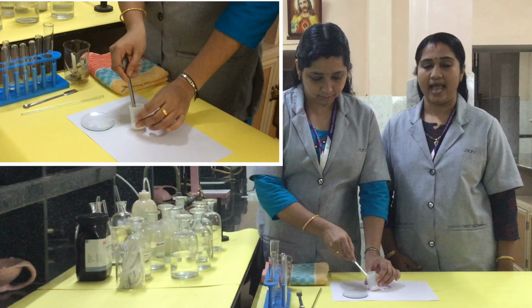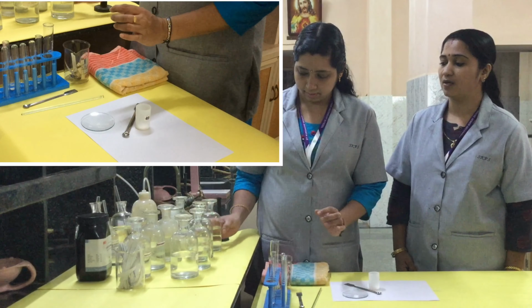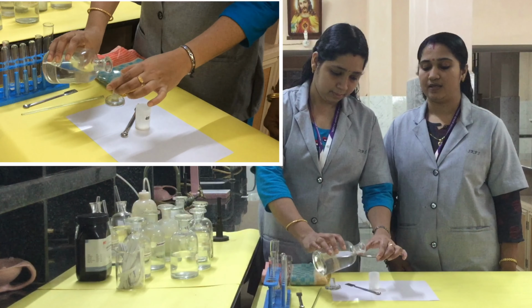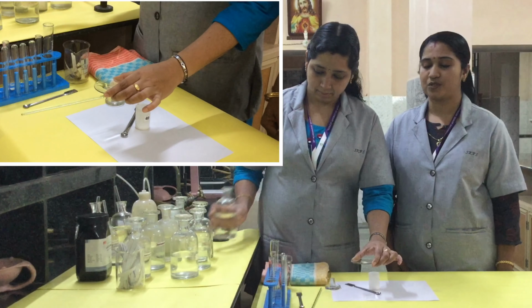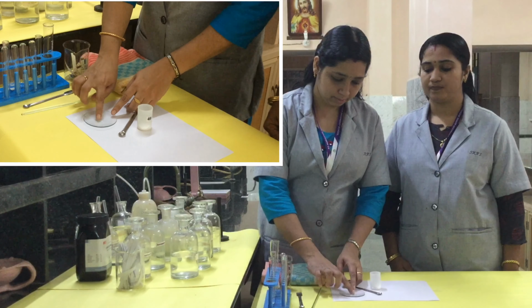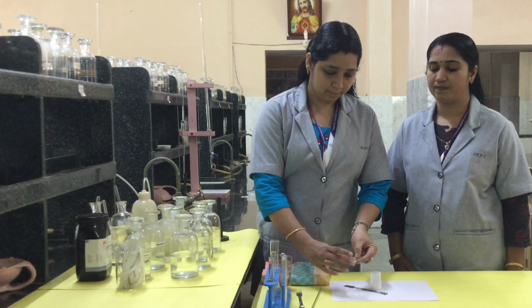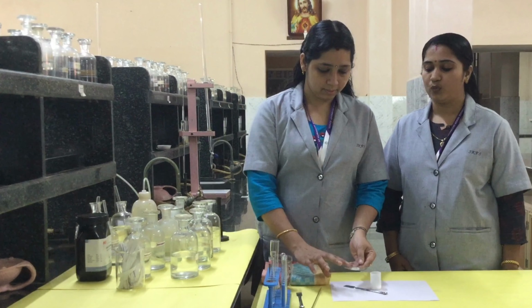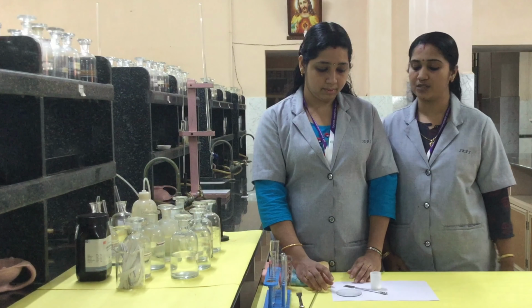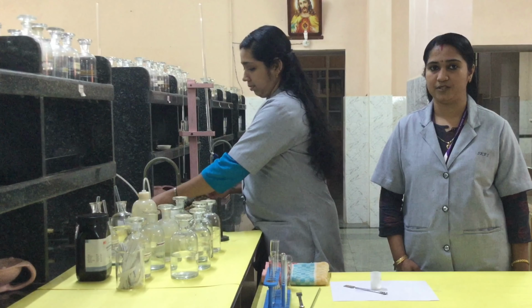Take a watch glass and add a little of the salt to it, and rub it with dilute sulfuric acid. A little dilute H2SO4 is added to it, then rub the salt. Note down the smell. Is there a vinegar-like smell? There is no smell of vinegar. So acetate is absent. The test is negative.